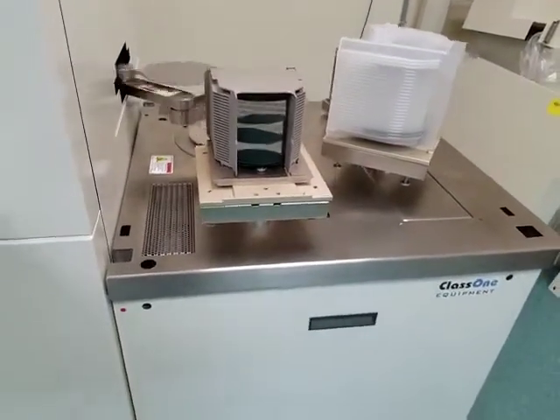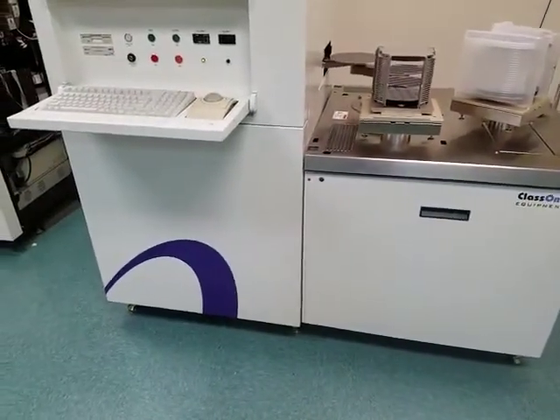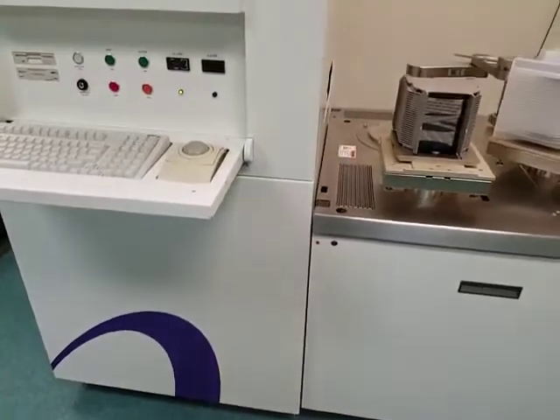It has a new xenon lamp, new lamp window, replaced the paraboloid mirror. Keyboard, trackball, and mouse are all functional.